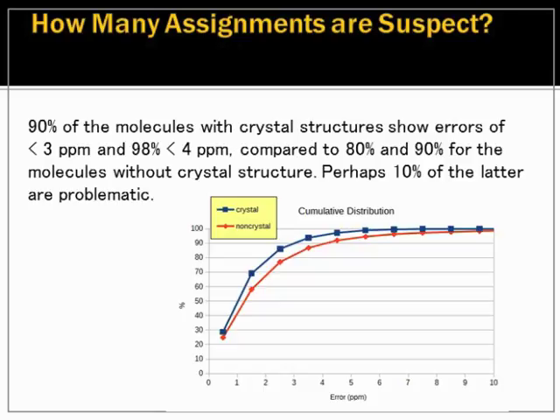So we've gone down by about 10%. What this tells me is that 10% of that second set are problematic. My suggestion here is that the computational technique is a great filter. At the point where there is an NMR spectrum and a proposed structure, it's a great filter to really say that the proposed structure is either reasonable or it's wrong.